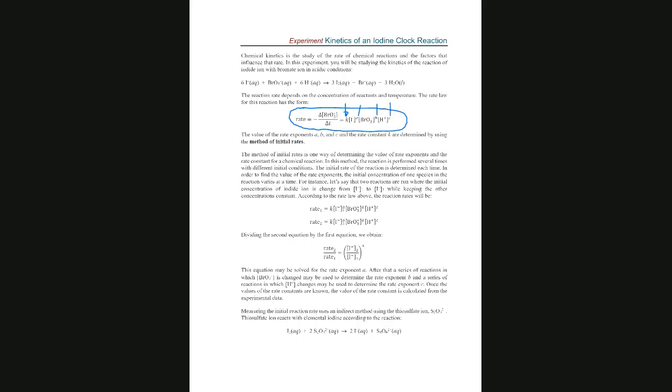Now, it's very, very, very important that you know that these numbers, called order of the reactions, are only determined experimentally. Never think that it has something to do with the coefficient of the reaction. No, no, no, has nothing to do. We have here the balanced equation, right? Very good. But experimentally, the objective of today's experiment is to obtain A, B, C, and the constant.